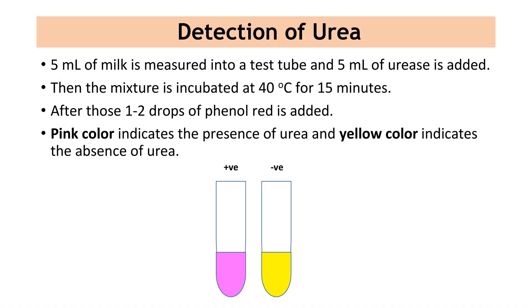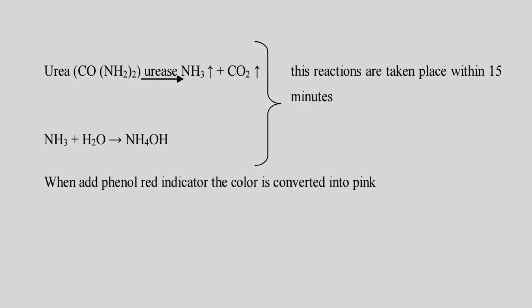Now let's see how to detect urea. For that, 5 ml of milk is measured into a test tube and 5 ml of urease is added. Then the mixture is incubated at 40°C for 15 minutes. After that, 1-2 drops of phenol red is added. Pink color indicates the presence of urea and yellow color indicates the absence of urea. Here you can see the chemical reaction: urea is converted to ammonia and carbon dioxide by urease, and the ammonia can be observed as ammonium hydroxide. These reactions take place within 15 minutes and when phenol red indicator is added, the color is converted to pink.